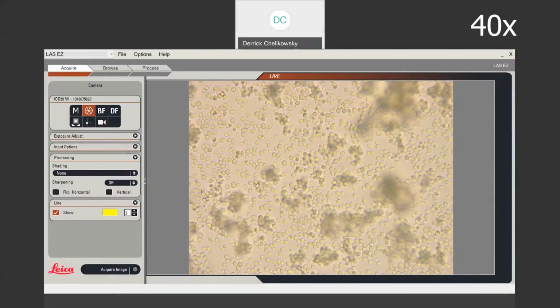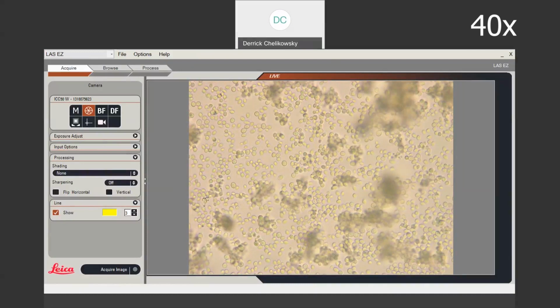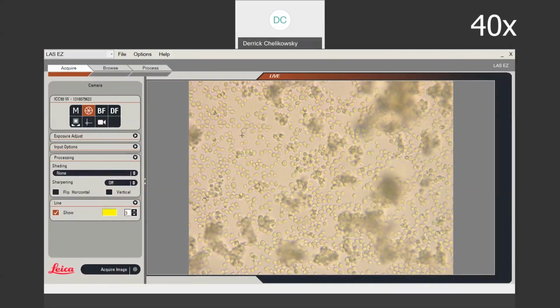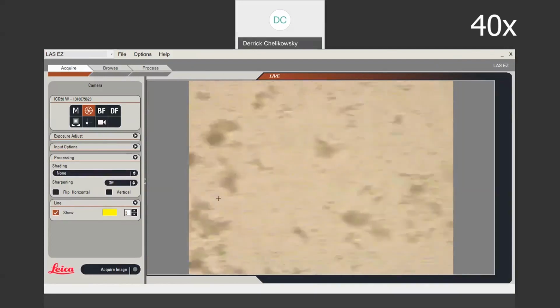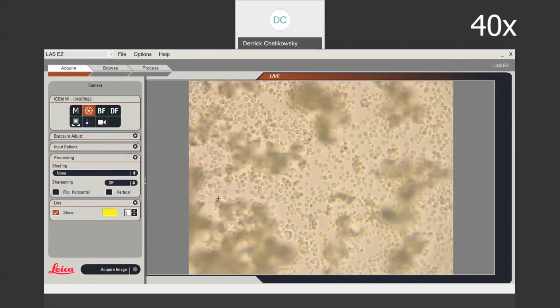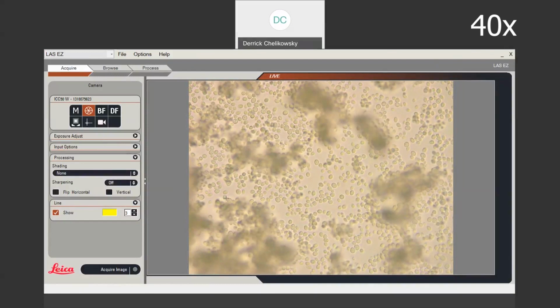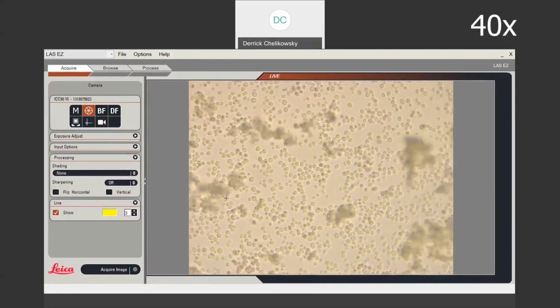That shaking that you'll notice is not the shaking of the cells themselves, and it is not due to an unstable lab setup. Really what I'm circling now with my pointer is what we're looking for. That's called Brownian movement. And Brownian movement is movement of the cell due to physical forces around the cell, water tension, kinetic energy, that type of thing, rather than true movement with things like a flagella.